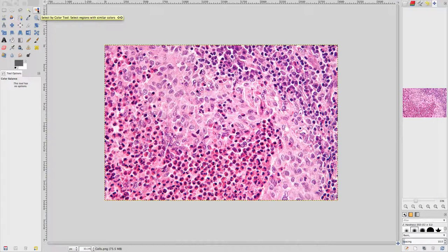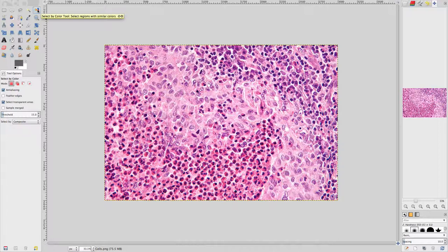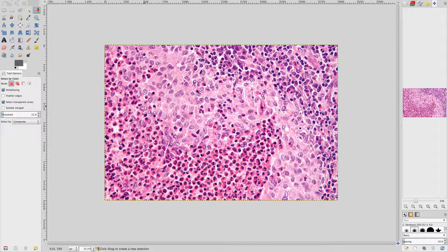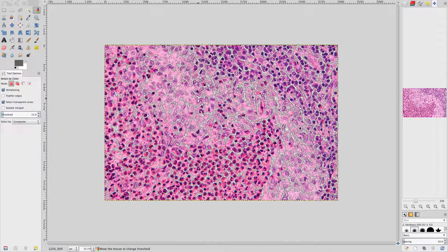Ensure that the tool options are configured as displayed here. Click on a white pixel in the image and notice that other similarly colored pixels are also selected. This can be a useful way of selecting areas of pixels in an image. Adjusting the threshold option for the tool will expand or contract the range of similar color pixels that are selected. Go to the Select menu and click None.